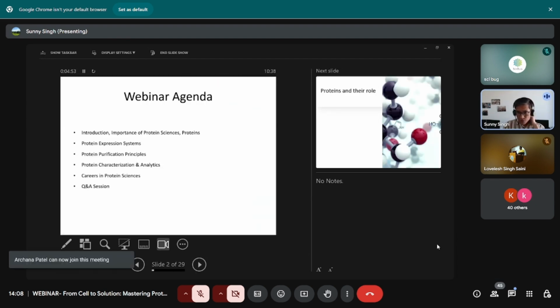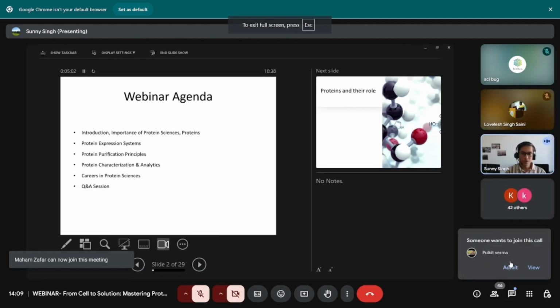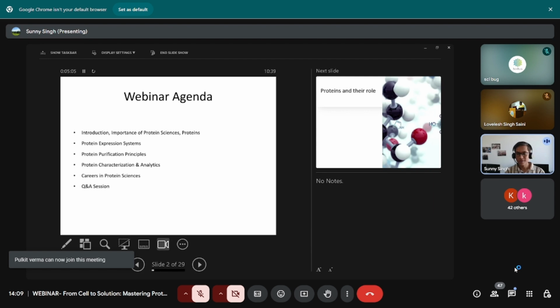In this webinar, I will give you an introduction, telling you what I'm going to talk about. The importance of protein sciences: what are proteins and how important are they? What are the different protein expression systems? What are the protein purification principles? And what are the ways in which you go about doing protein purification? Because doing protein purification or cloning requires skills which come from repetitive learning, handling pipettes, pipetting small microliter volumes.